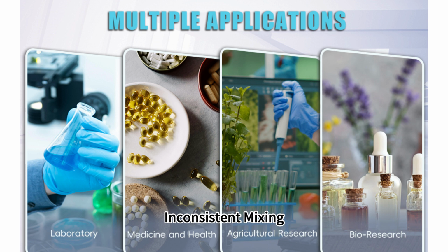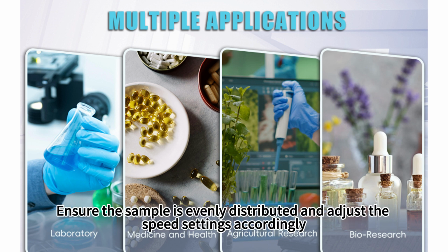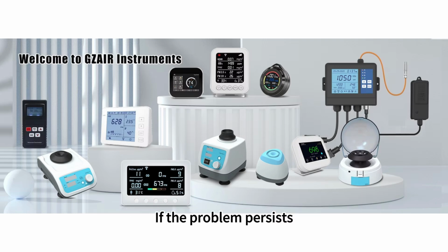4. Inconsistent mixing. Solution: check the mixing platform for wear or damage. Ensure the sample is evenly distributed and adjust the speed settings accordingly. If the problem persists, recalibration may be necessary.